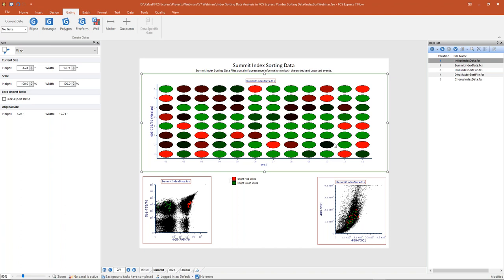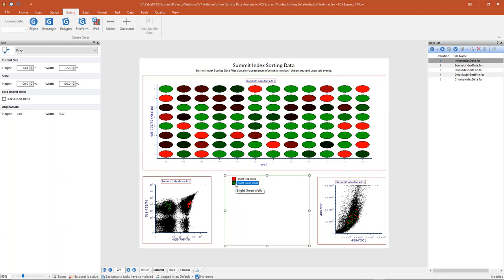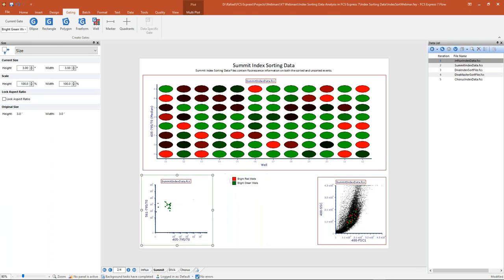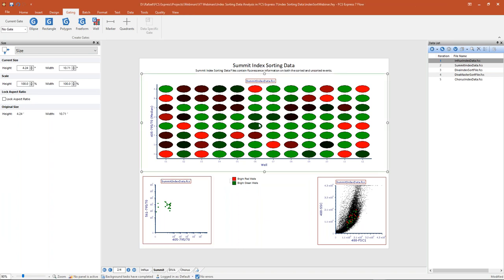Just like regular gates, we can use well gates and apply them to our plots. I can drag and drop my bright green wells gate onto the plot to my left, and then I'm only looking at the events within that gate. In our last example we used overlays to show two different statistics from the same set of data. For this Summit data, I want to show you another way to show multiple statistics — using the radius statistic to control the size of the radius of our wells.